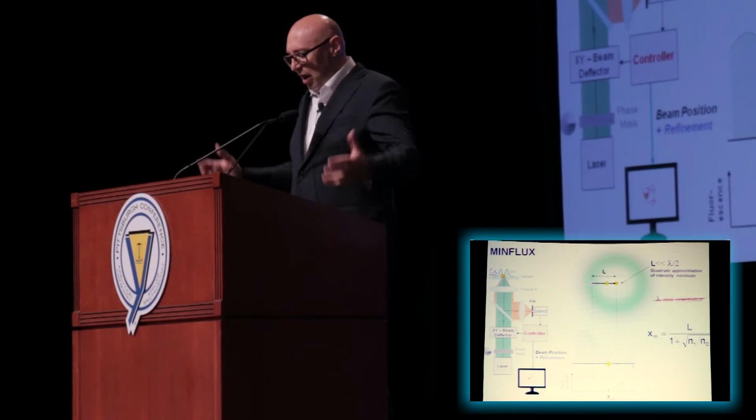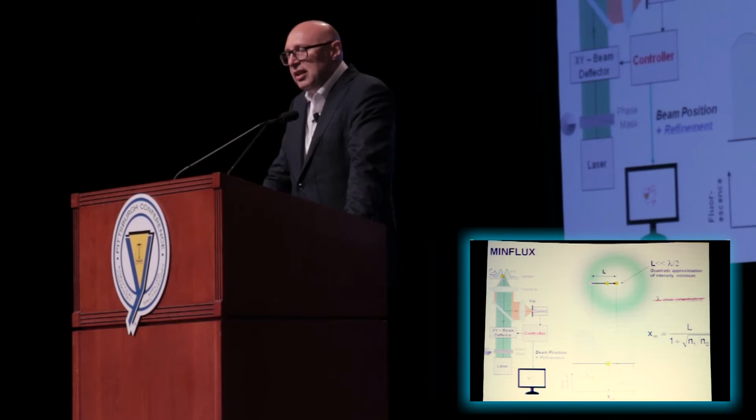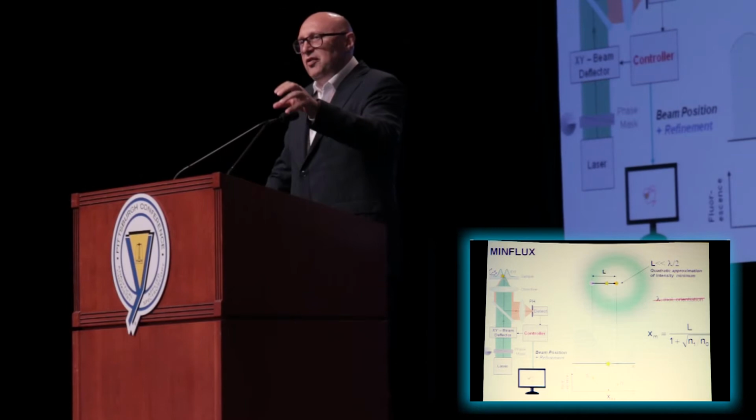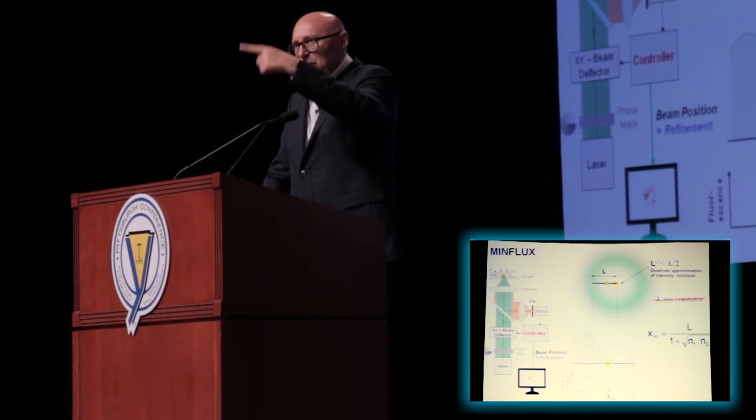And this may look strange at first, because we use focused light, and of course light has a finite wavelength, but if you think about it, it's not that strange. Because in the end, the molecule is a singularity, if you will, it's just a point. And then we check the position of that point with another point, which is the zero of that intensity profile. So basically we use two points.